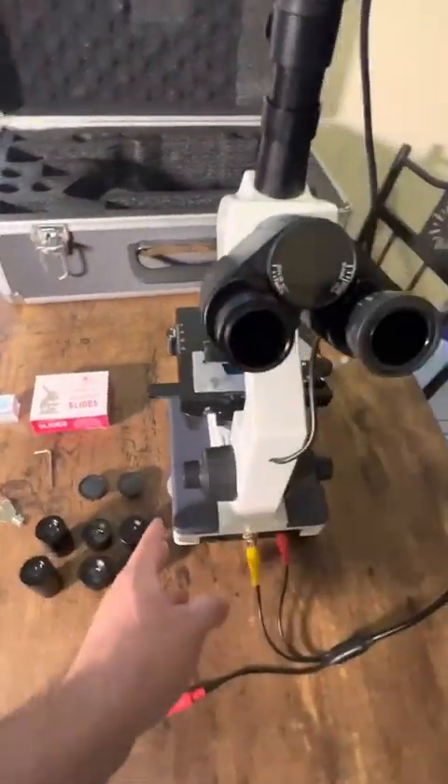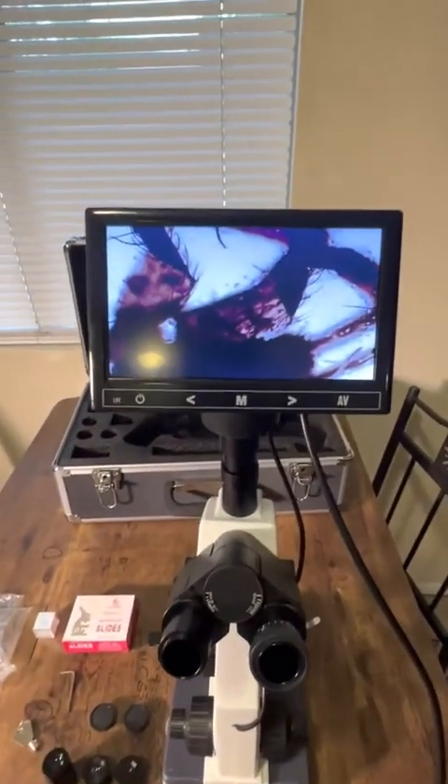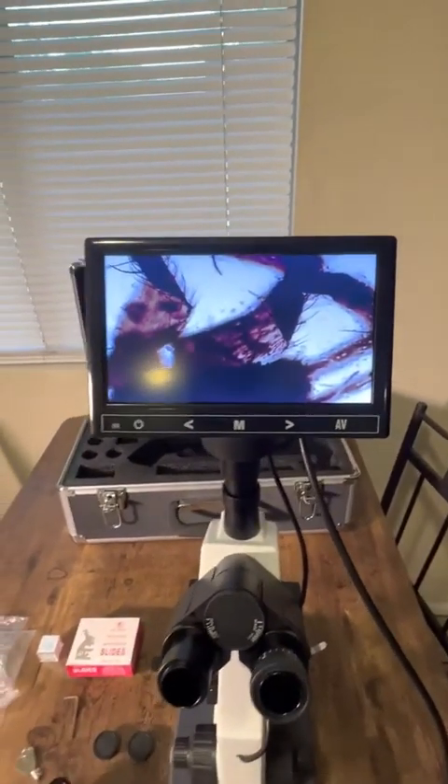This thing is super awesome. If you need something like this or just want a cool microscope, definitely check this out. I hope this review was helpful — thank you.